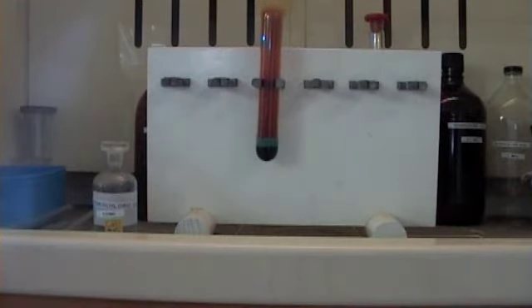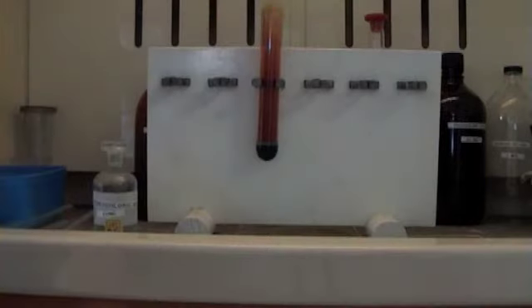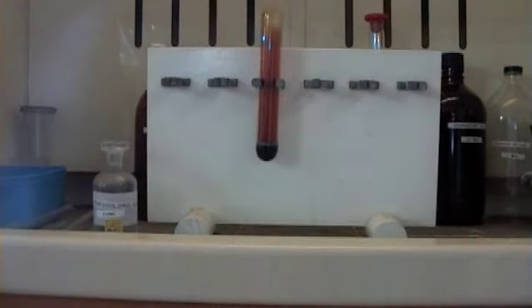Now I'll just let that run its course and then I'm going to show you the difference between copper ions in a very concentrated form there, which is a green colour, and in a diluted form by adding some water to it. So we can see hydrated copper ions. That's not a redox process, it's just a hydration one.